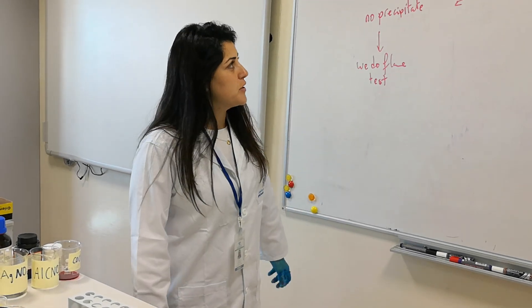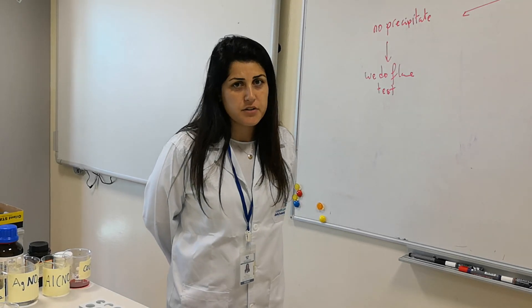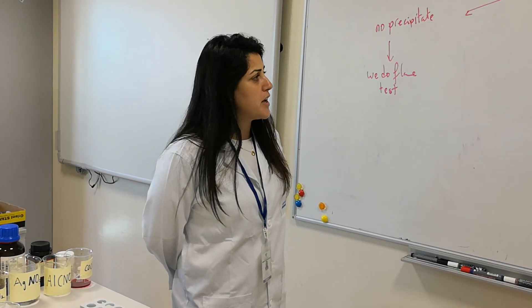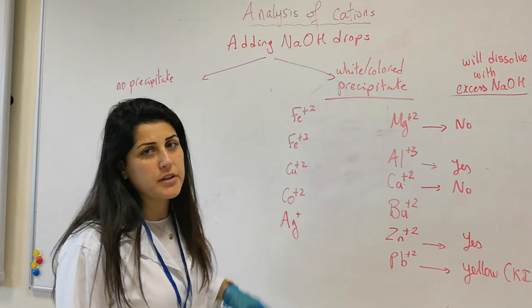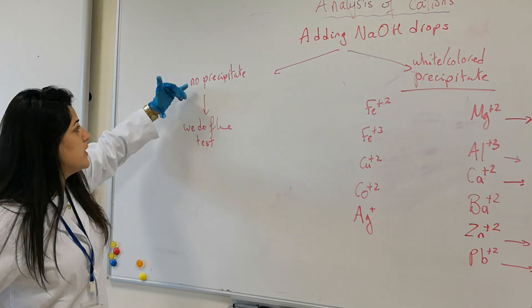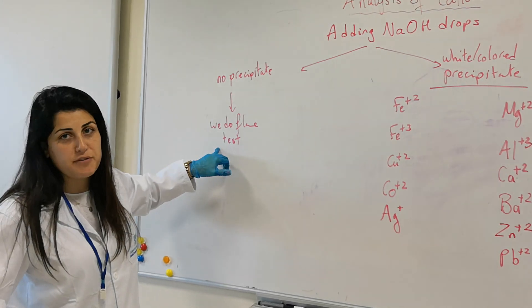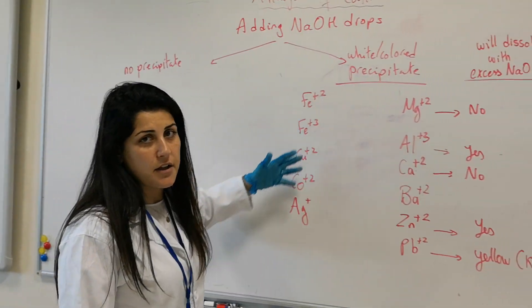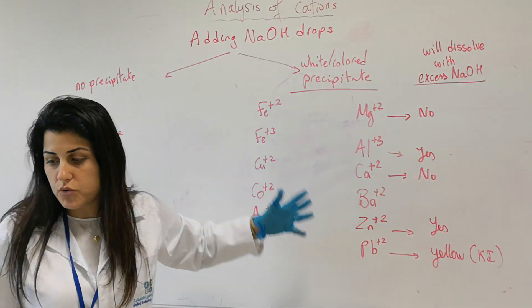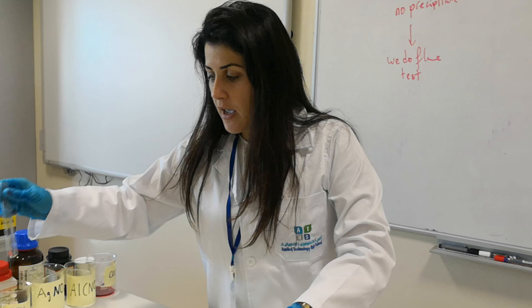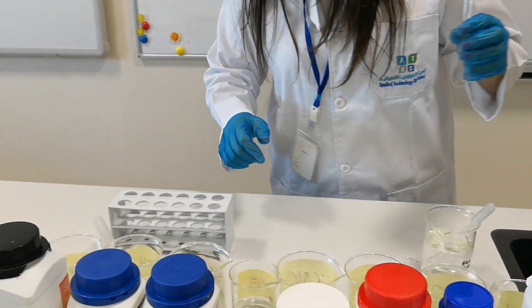In today's experiment we are going to do a qualitative analysis for the cations. Anytime I have a cation solution, the best way to identify them is to add sodium hydroxide drops. Some cations will not form a precipitate, so we will identify those by doing the flame test. Other cations will form a white precipitate or a colored precipitate. I'm going to take a sample from a different cation every time and add sodium hydroxide to it.